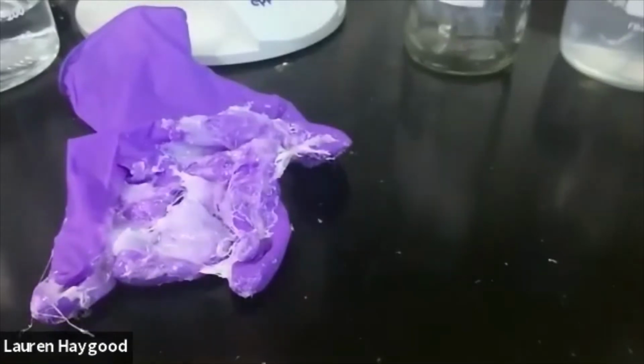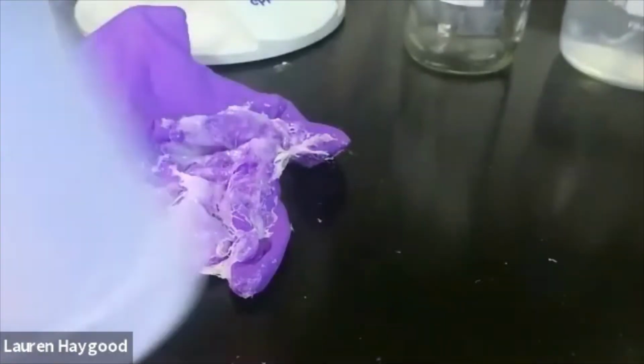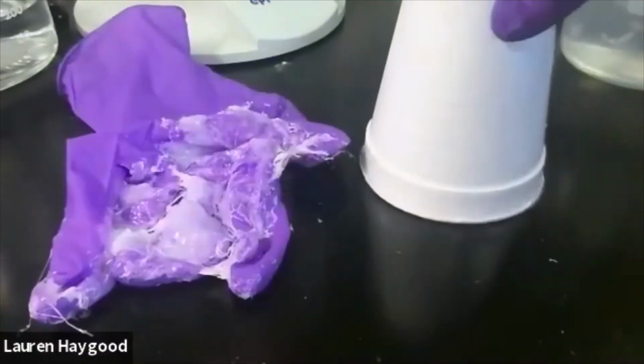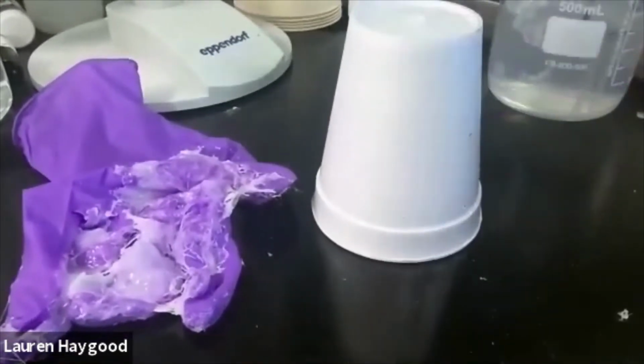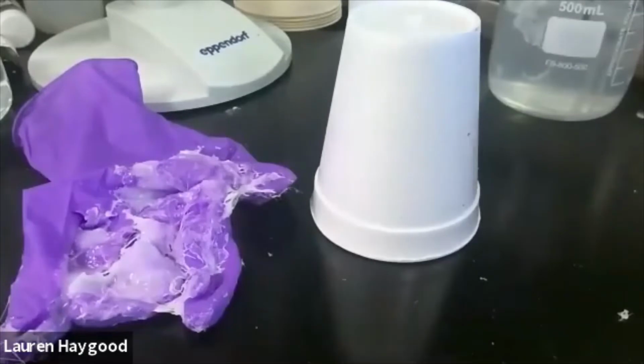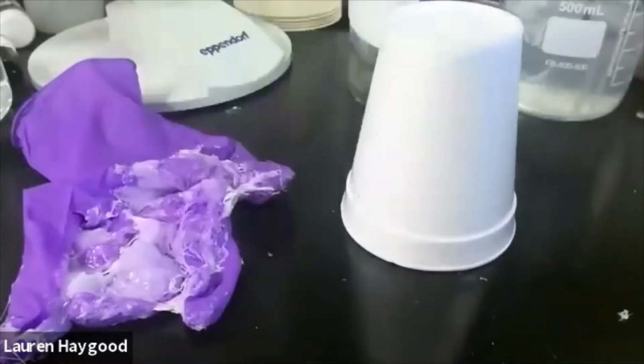And so basically what we did was we showed like dissolves like. We showed that nonpolar will dissolve nonpolar and that opposites are not going to dissolve each other. And we also showed that this foam cup, which can hold our hot chocolate, can hold our water, will actually dissolve and resolidify into plastic.